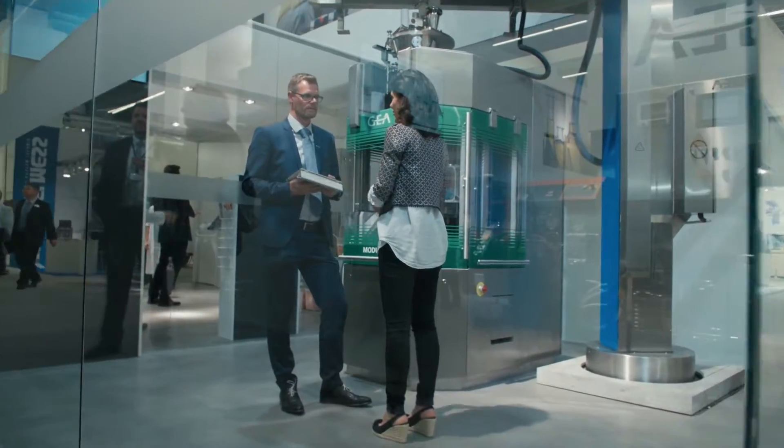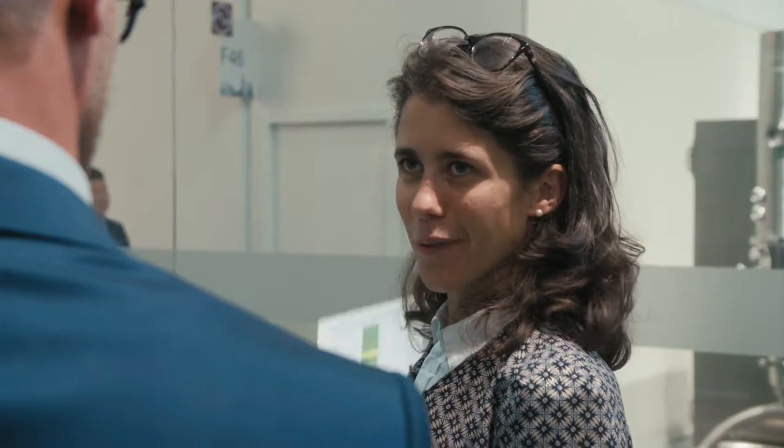This machine here behind me is a GEA rotary tablet press equipped with a specifically designed MUPS infeed system. MUPS is a special dosage form — it's a blend between pellets and excipients, and that blend has a strong tendency for segregation. Also, to achieve good quality tablets, it is important not to damage or destroy the coating of the pellets.